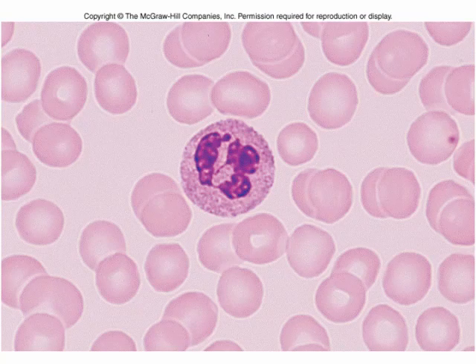All right, here's another slide showing a neutrophil. Again, you can see the various lobes of the nucleus, anywhere from 2 to 3, 4, 5, 6, 7 lobes in that nucleus. Lots of red blood cells around it.